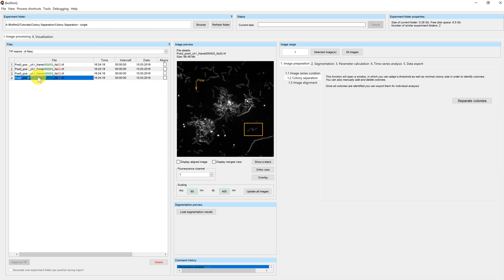This is how the colony separation works for a single file. In most cases, you have multiple images from different time points. Let's have a look how this works with the colony separator.